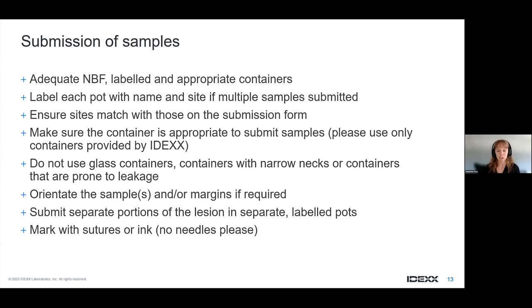I always say ink, but I know that in practice, ink is not very common. So you might not have, or you might maybe have one ink, but not different colors. So I think sutures, long sutures, short sutures, no sutures, as long as you tell us on the submission form what you've done, are also really, really helpful.